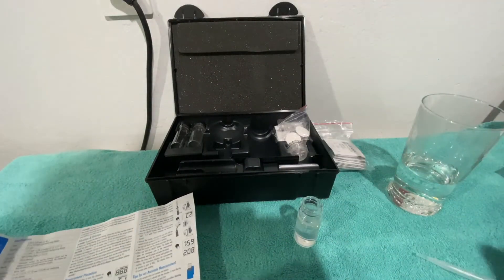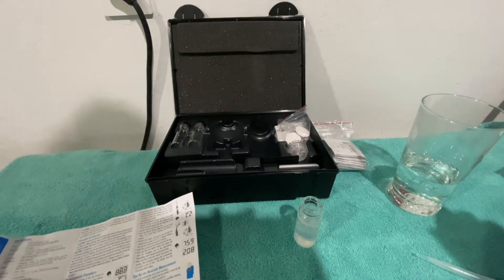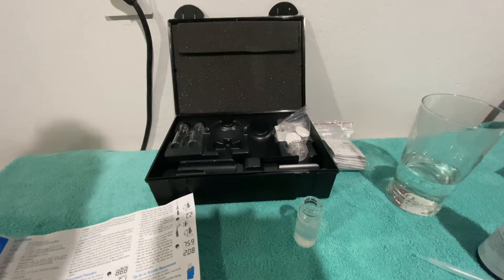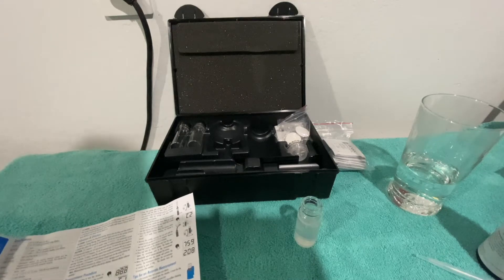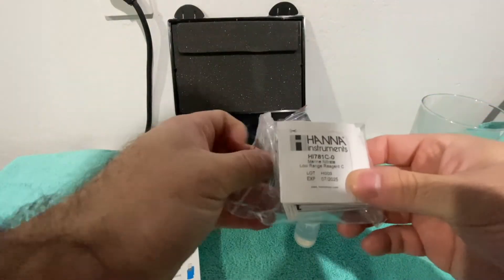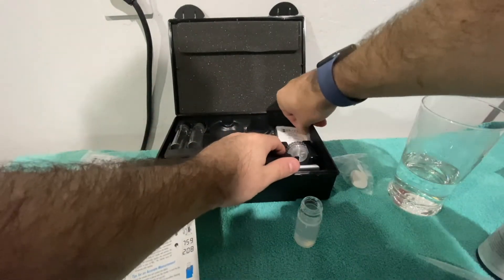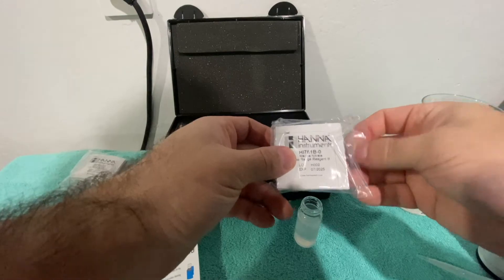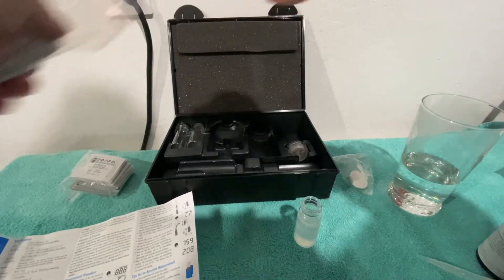Pop that in there. After that it says to put in the HI781BO packet. If you look at these packets, they are different — this one says CO and this one says BO — so it says to put the BO packet in.